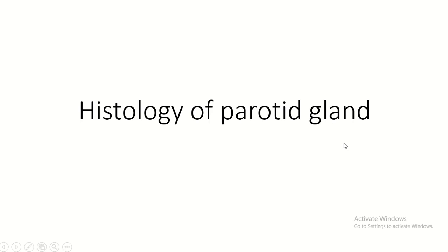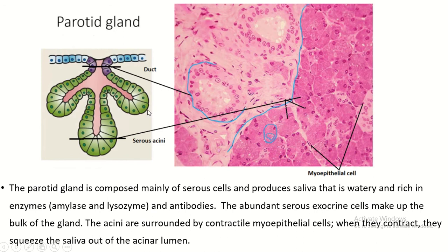Welcome to the human anatomy channel. In this video I discuss histology of the parotid gland. The parotid gland is a pure serous salivary gland. It has ducts and serous acini. Cross sections of the duct look like this — the staining of the duct is less than the serous acini.